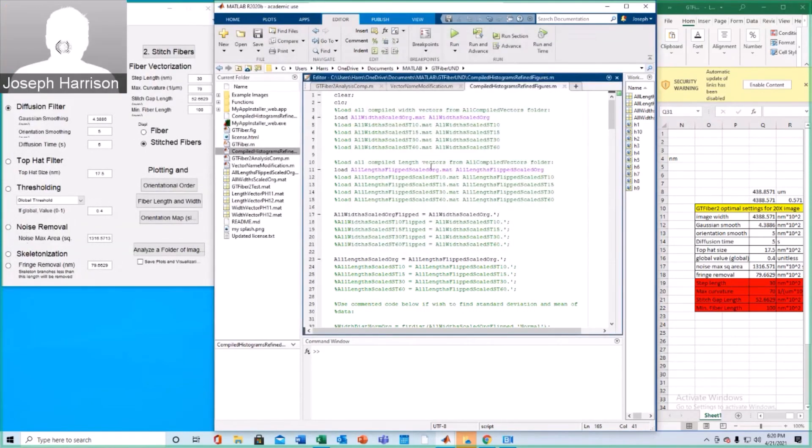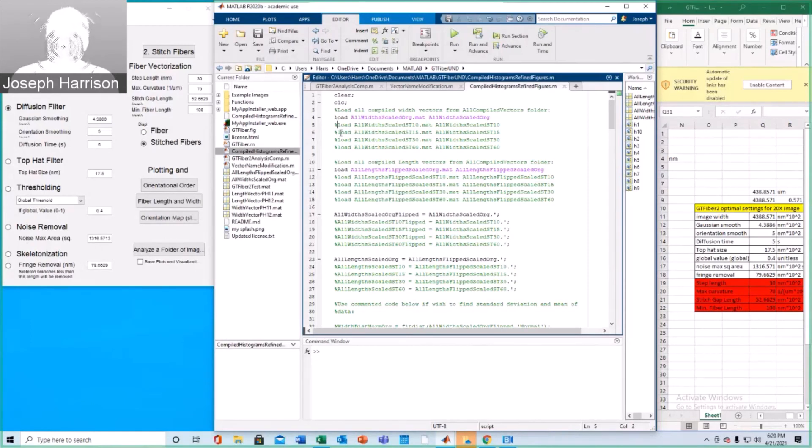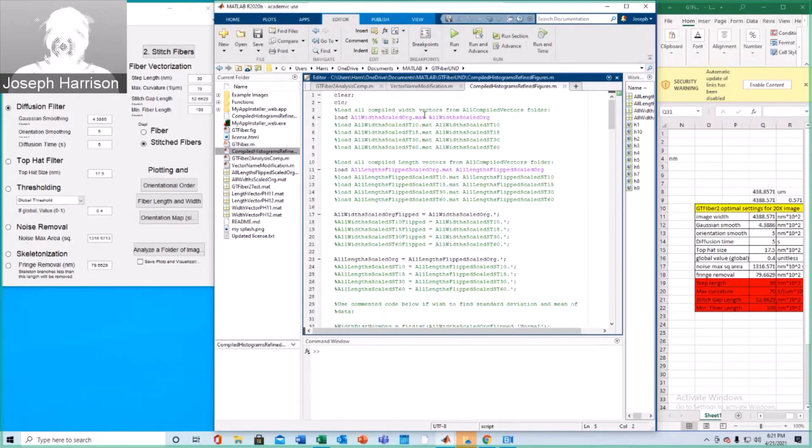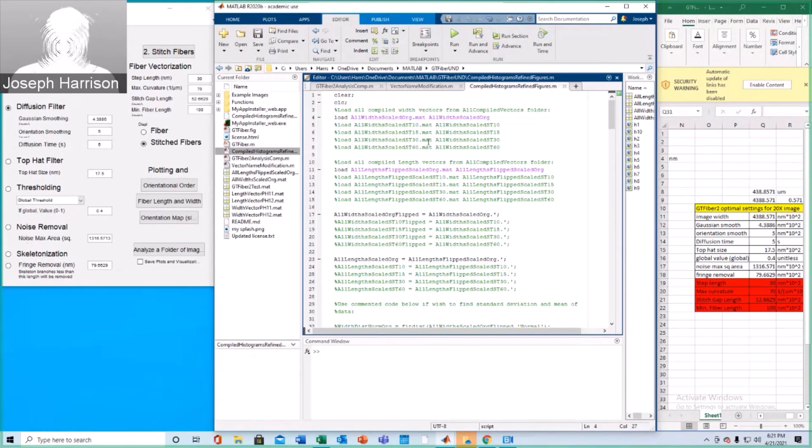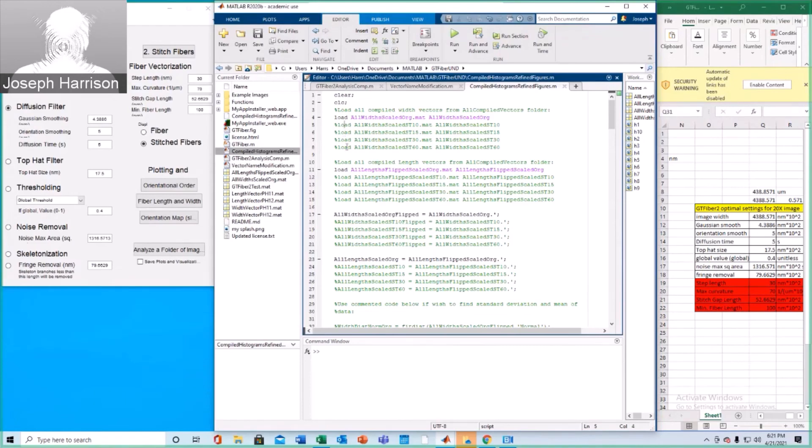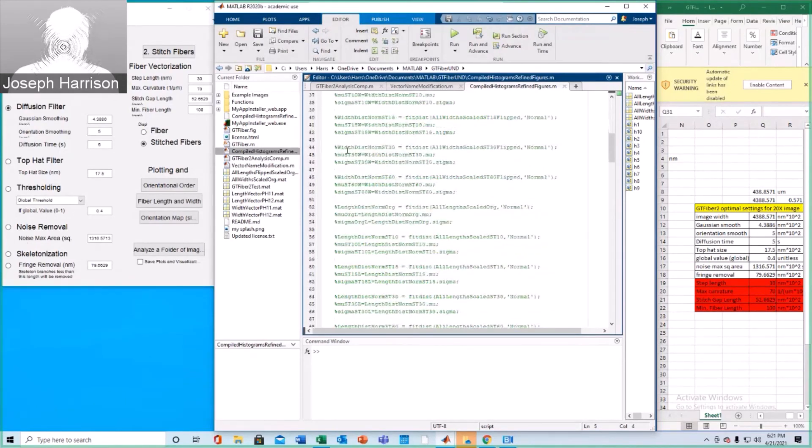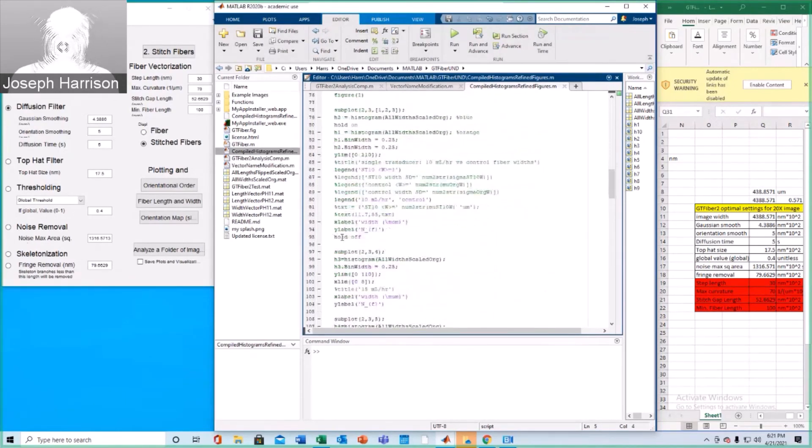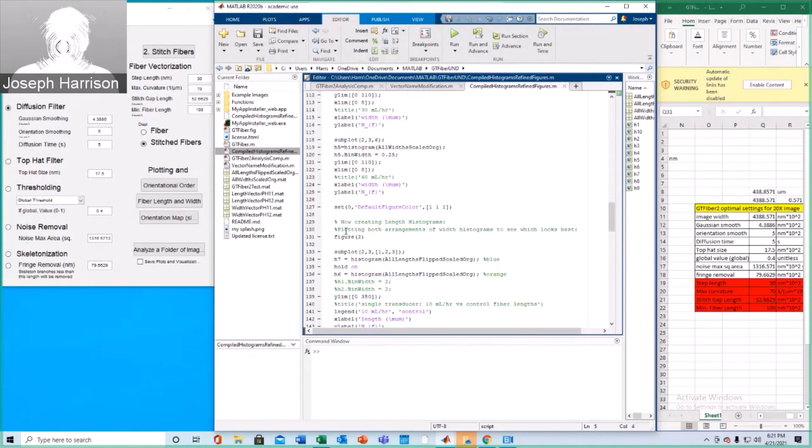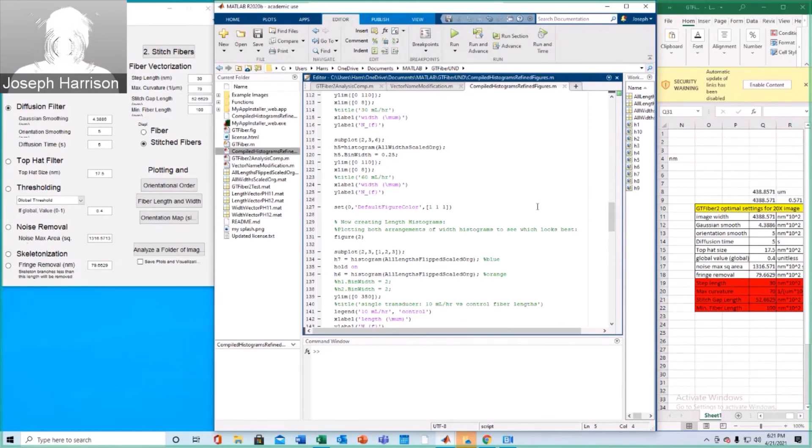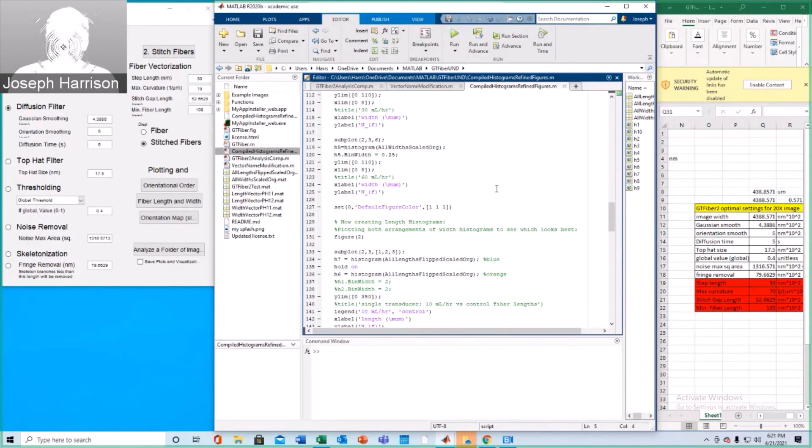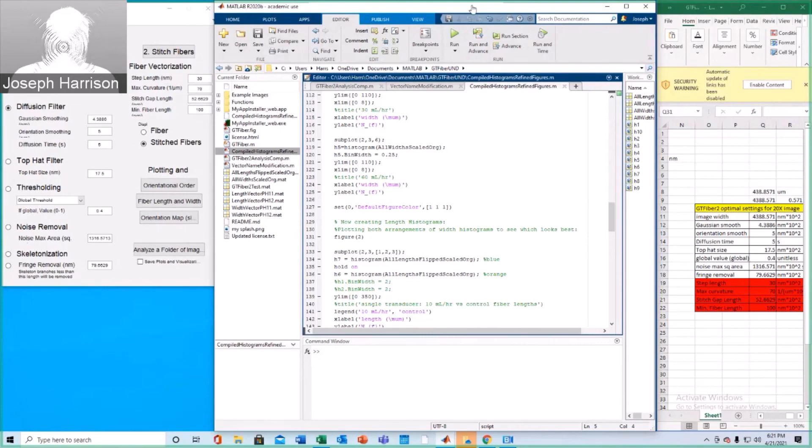Alright, and whenever you're done, make sure to uncomment out everything such that you have it in sort of a standard way. Obviously, this is up to some sort of preference of the user, but if you commonly are going to analyze three or four folders, maybe only leave the corresponding number here commented out. I'll leave it as is for now. Alright, and that concludes the GT Fiber UND image analysis tutorial. If you have any questions, feel free to contact me at jharrison86 at students.gatech.edu. Thank you for your time.